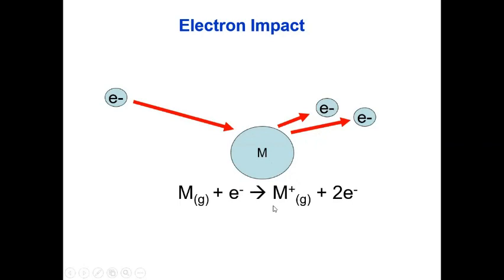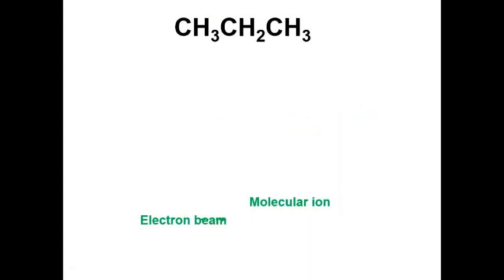As I told, the condition of mass spectrometry is that we have to ionize the molecule to get a mass spectrum. So here we will see what the principle is, how we get a mass spectrum of a molecule, and how the molecules get ionized and give different peaks in the mass spectrum, and how by those different peaks we can decide the unknown compound present in a sample.